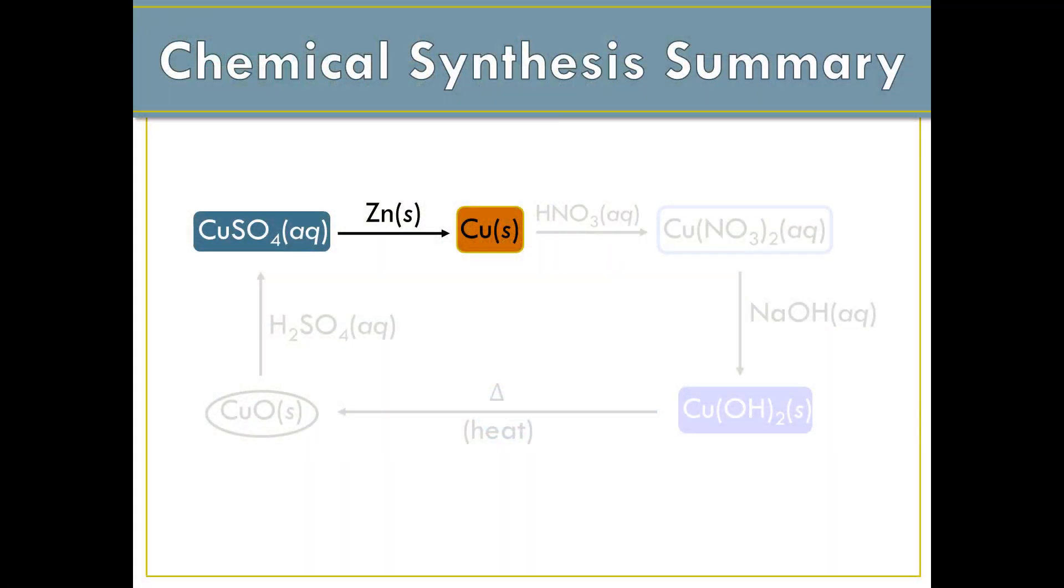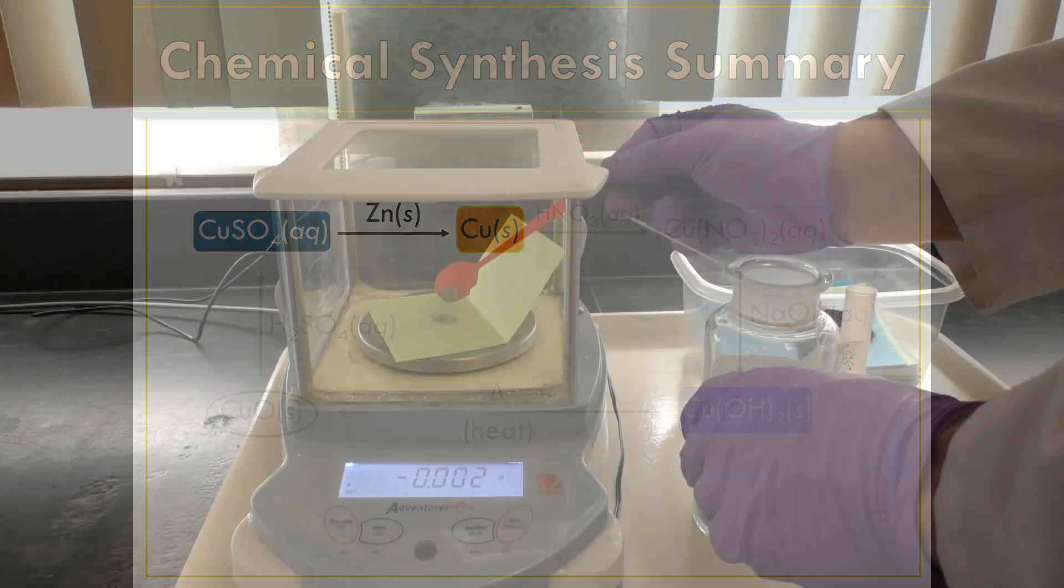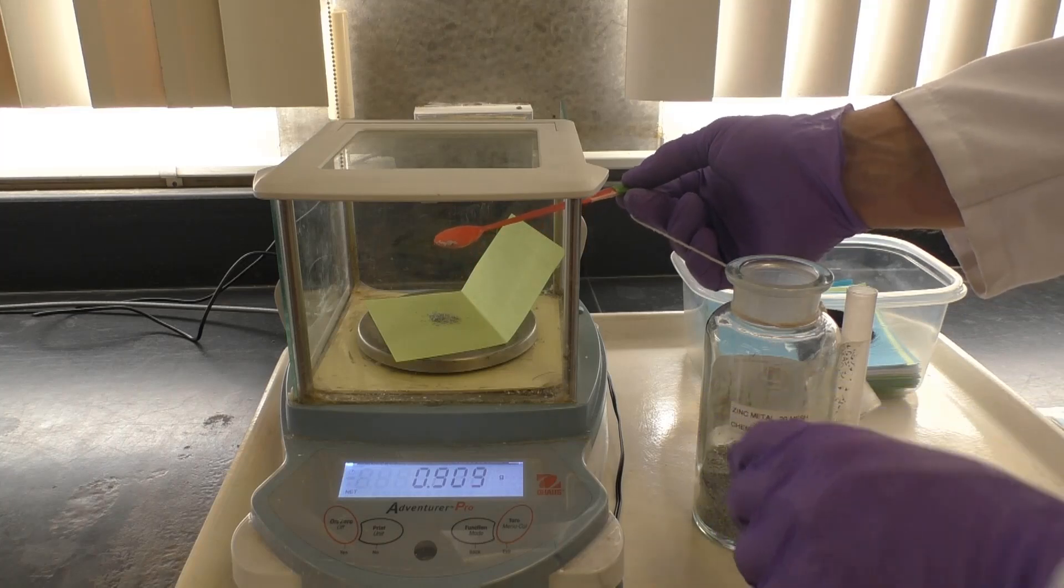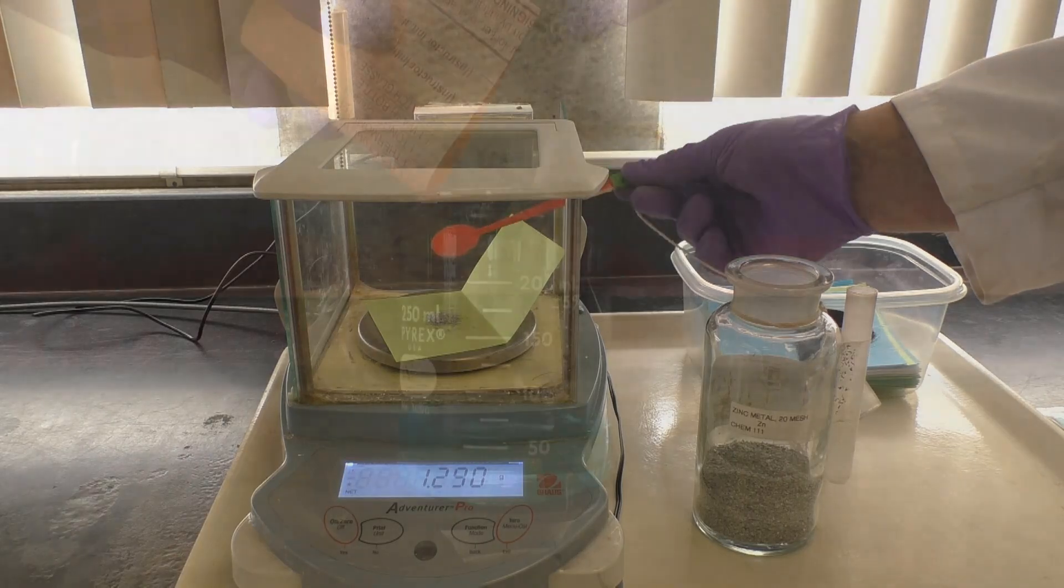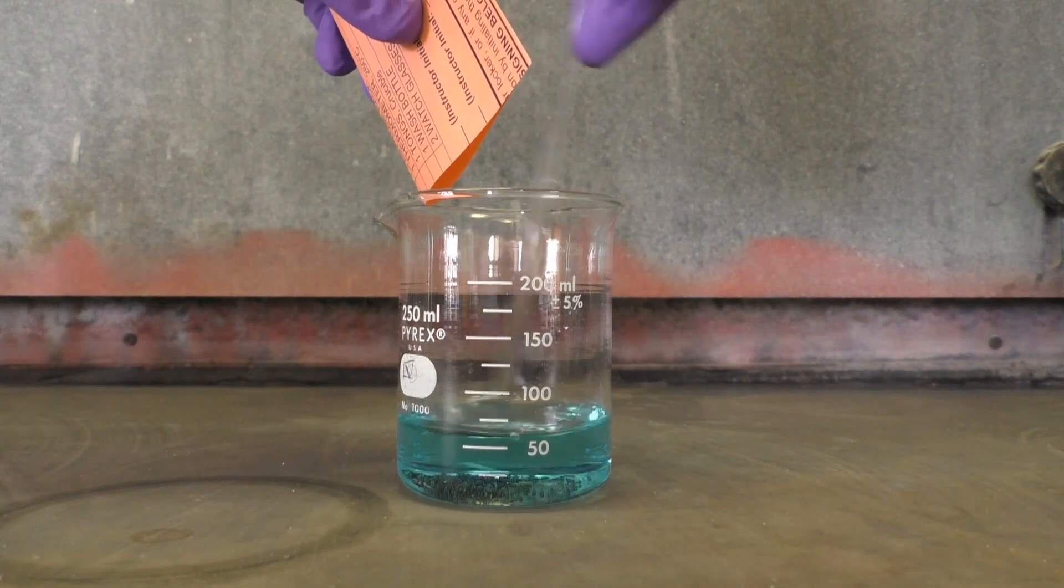The final step of our synthesis is reduction of your copper-2-sulfate to copper metal by use of zinc. The copper changes oxidation state from plus 2 to 0 in this reaction. Thus, this is a redox reaction. After weighing out about 1.5 grams of zinc turnings, add this to your copper-2-sulfate.